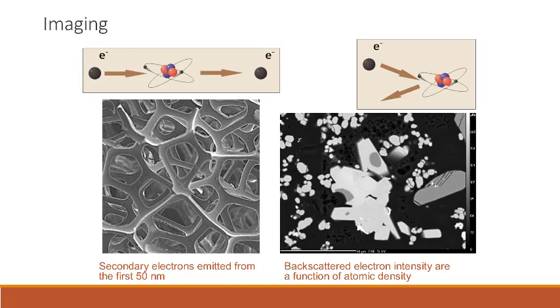They are grayscale, as electron images are, but the brighter grayscale on this image belongs to grains of magnetite, whereas the lesser gray, particularly the grain off to the right, belongs to a feldspar. The black in the background actually belongs to a glass that has a much lower mean Z.